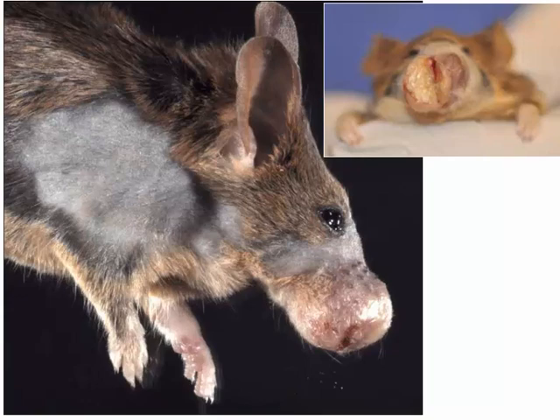So they're not only facial, you can see them throughout the body, all over the skin and underlying soft tissue, occasionally getting into the bone. Botryomycosis is a term that applies more to the appearance of these colonies surrounded by Splendore-Hoeppli material. You will see it occasionally used in other species and in various lungs. So it's not specific for mice, nor is it specific for skin infections. However, that is the most common usage in veterinary pathology.